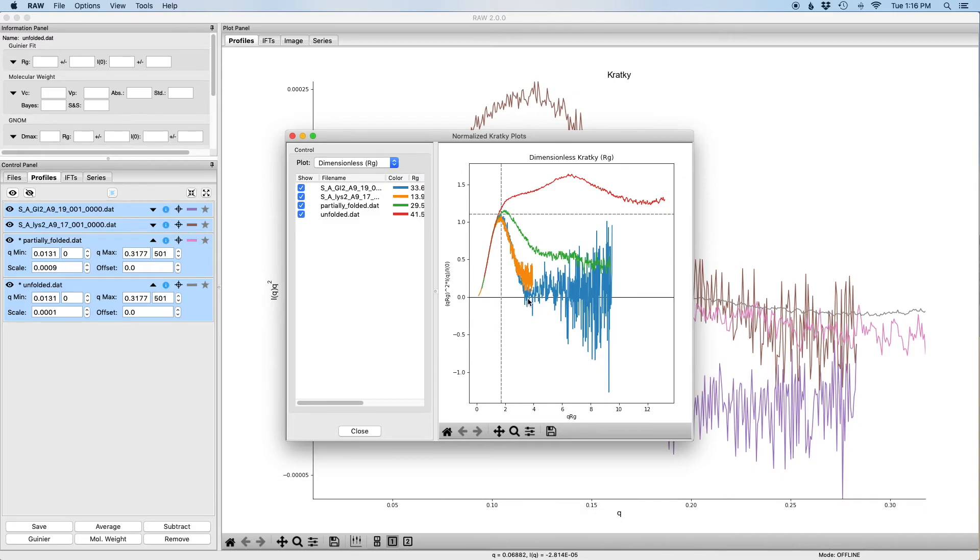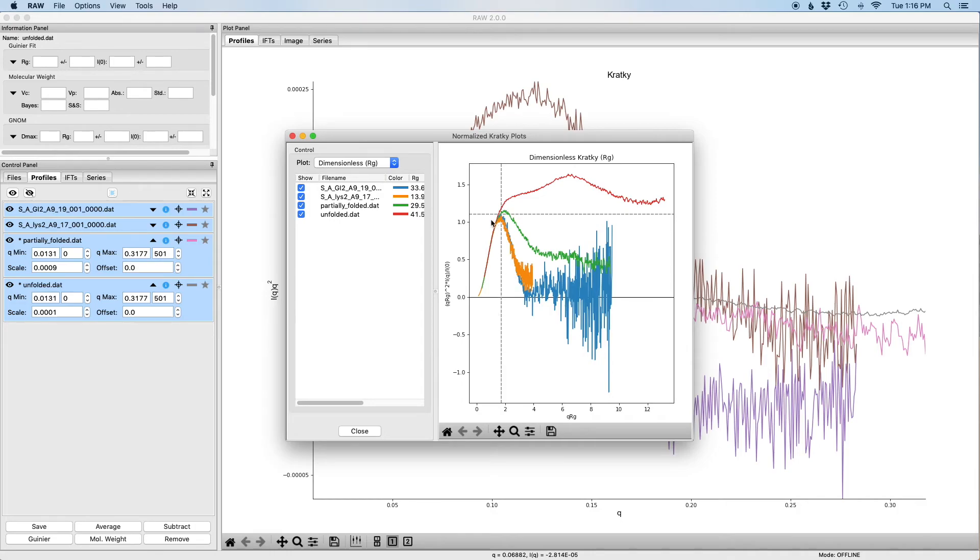And now you can see that very clearly the partially folded and the unfolded are very different from those on this plot.